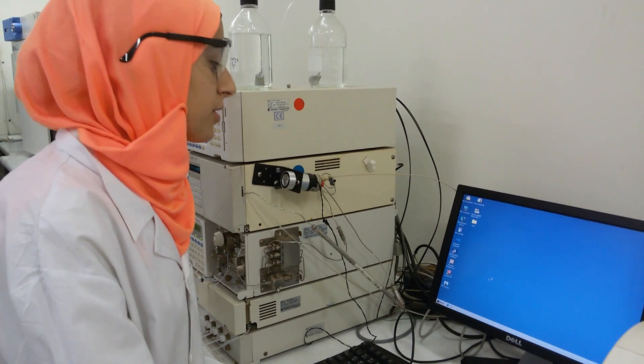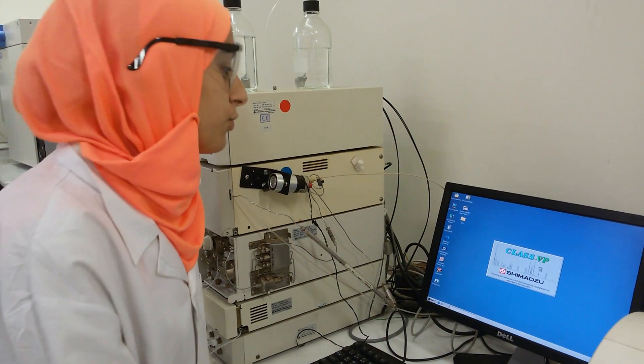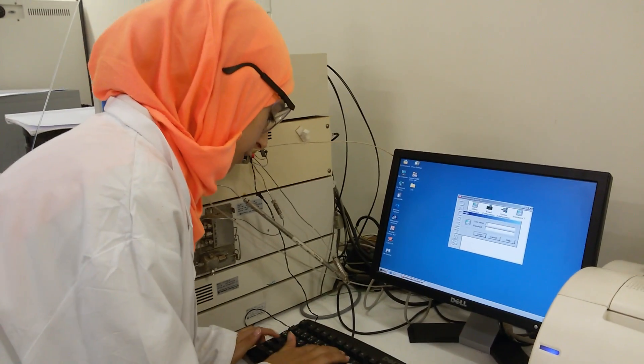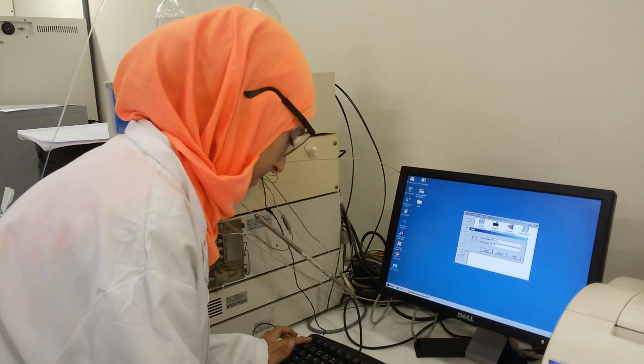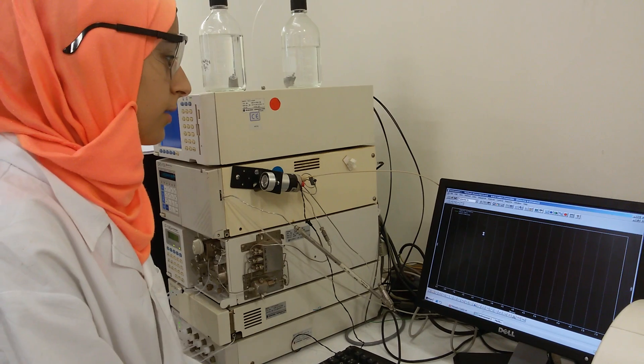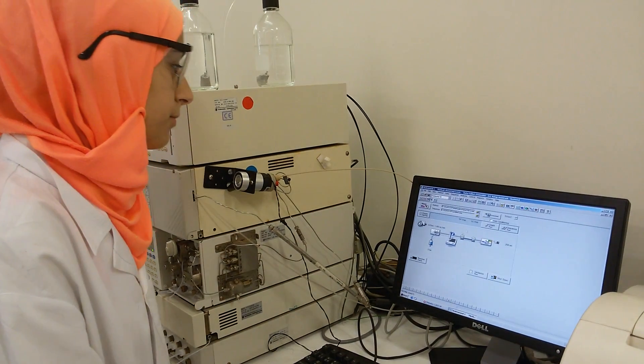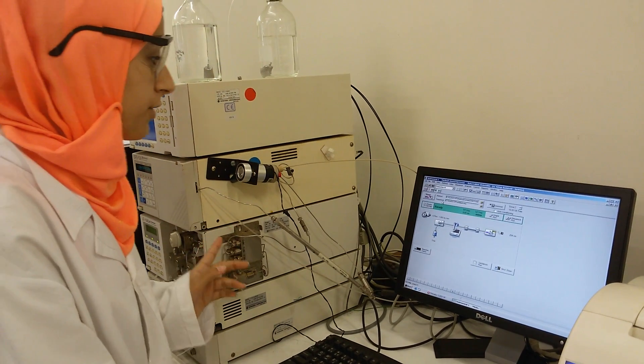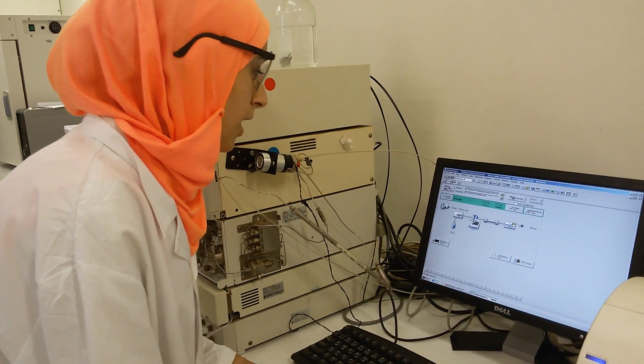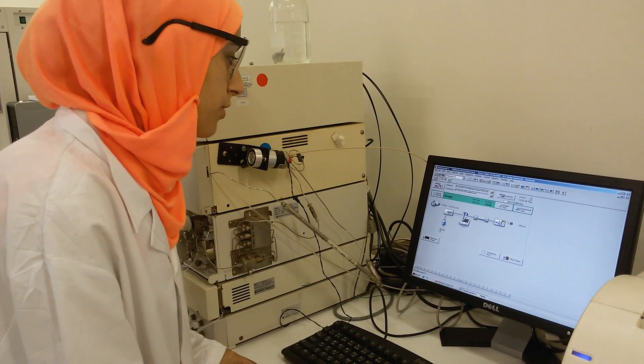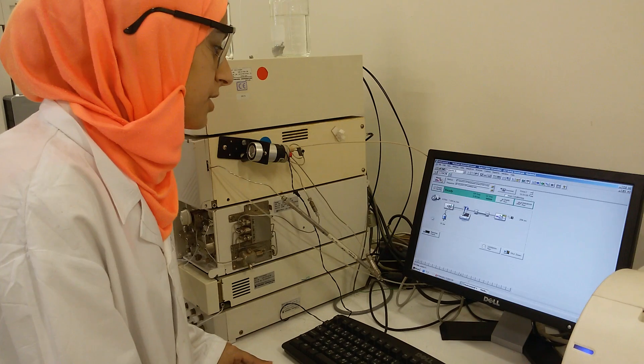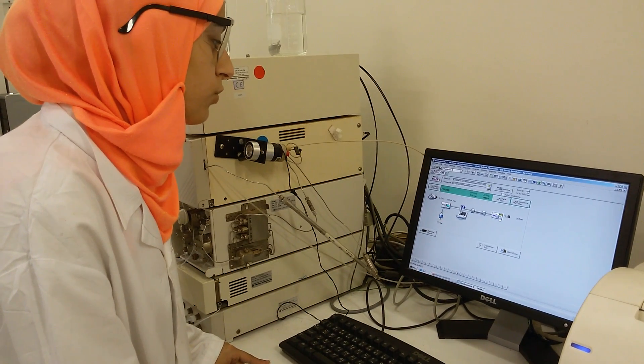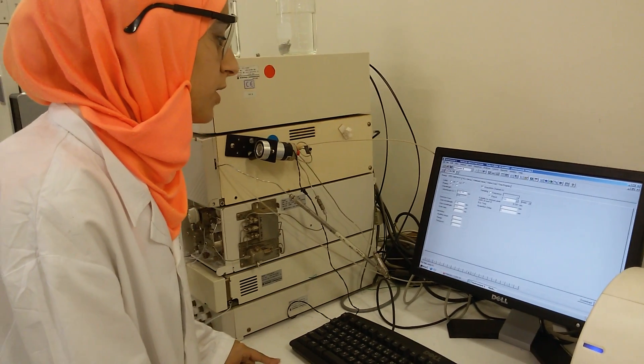So, this step will be about explaining the software techniques. After we turn on the computer, we click on the ClassVP, which is the software that we will need to work on. We click on Instrument 1, and we should adjust the username and password. Then, this screen should be applied with us. We click on this first button to turn on the instrument. Then, the second one is for turning on these two pumps. We should make sure that this pressure is around 200 bars. After this pressure has become around 200, we should click on this button to adjust the specific wavelength that we need to apply, which is 254 nanometers.